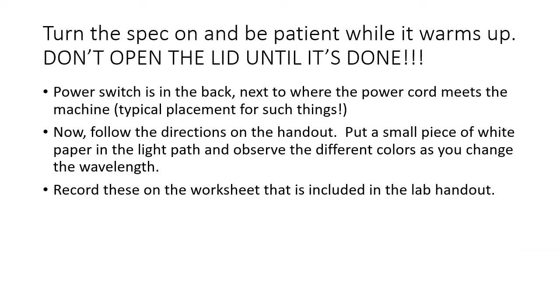Okay, so in terms of using the spec, some of these are getting a little ancient. It takes them a little while to get going sometimes. So when you turn it on, by means of the power switch in the back, let it warm up. Sometimes it sits there and it looks like it's not doing anything, but it is. And if you open the lid before it's done, it messes up its internal calibration. Now, if it looks like nothing's happening, turn the power off and then turn it back on again. So they all work, but you just have to be patient with them sometimes.